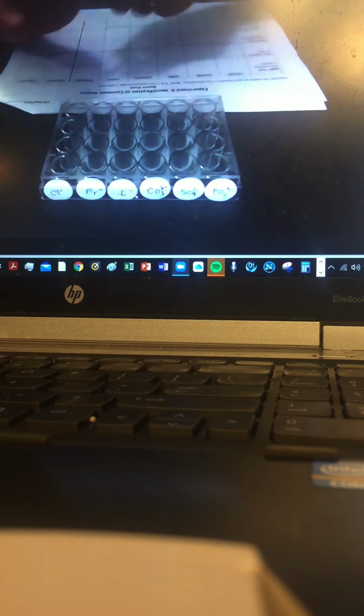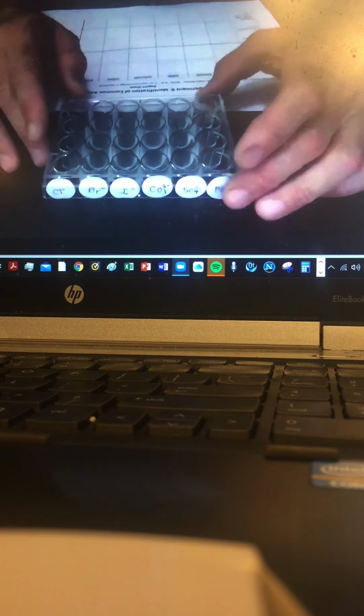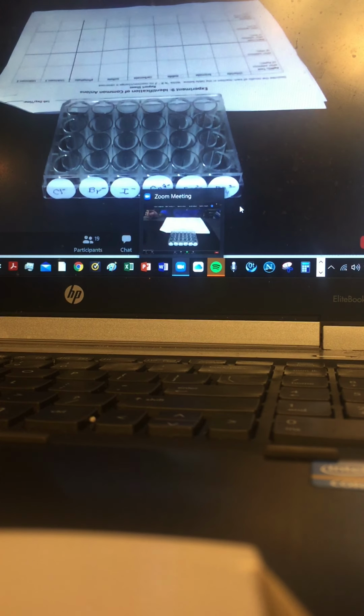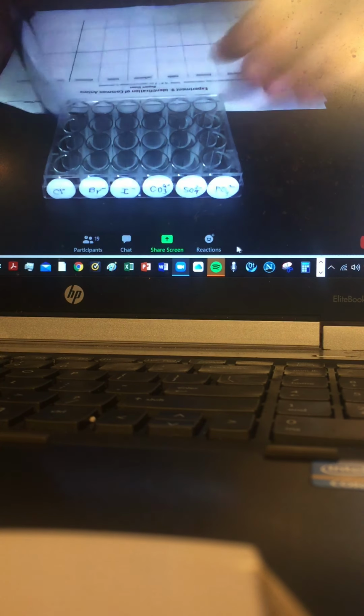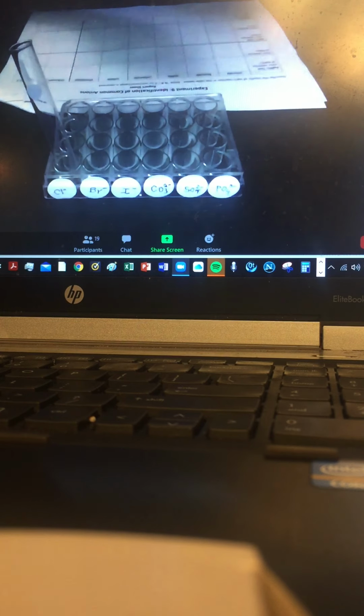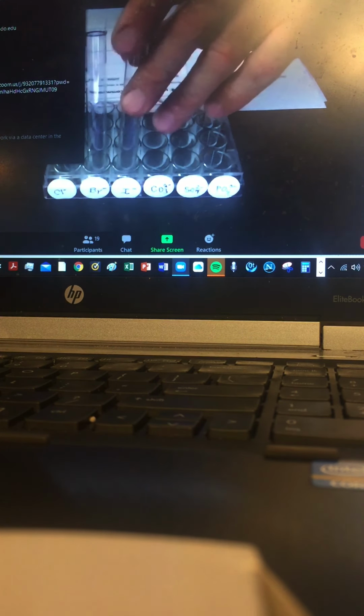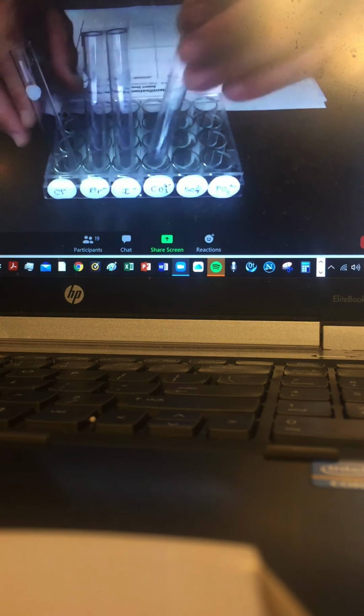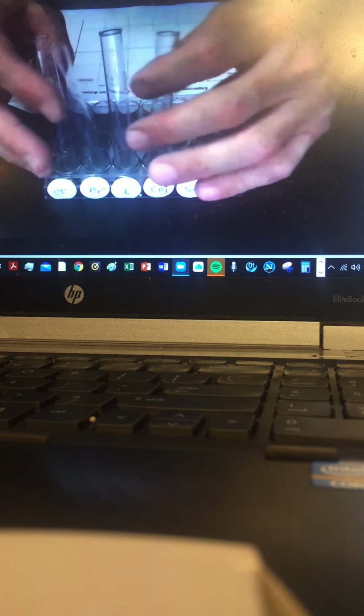Right now, I want to add the following. I need to bring in some test tubes, and I've got plenty of those. We're going to insert some of these test tubes in here. Hopefully they would not fall. It's not meant for a test tube holder, but I'm using it to have a clear picture of what's going on, because you need to see exactly what's going on.